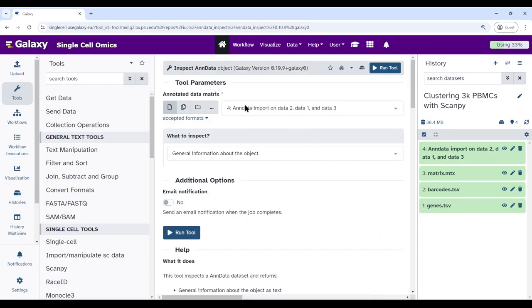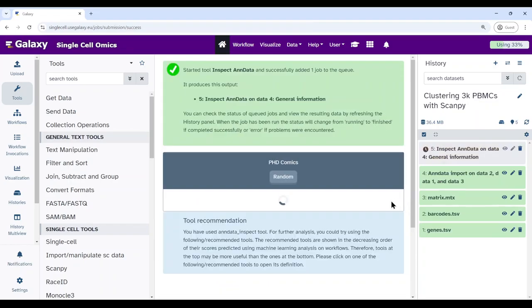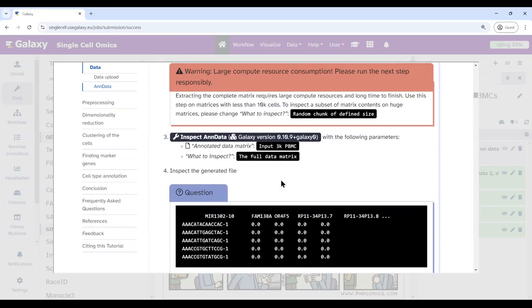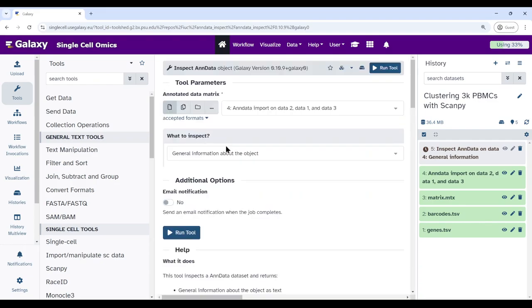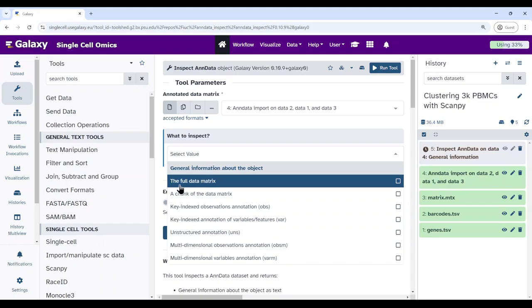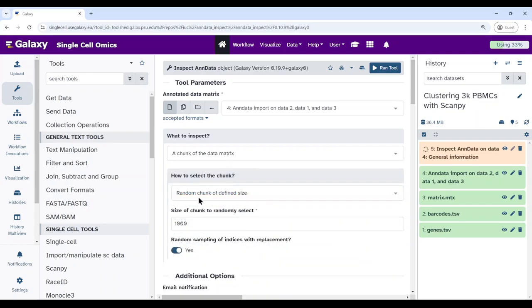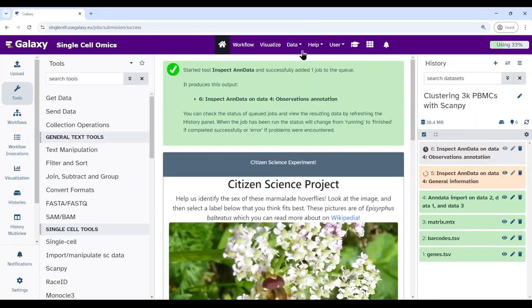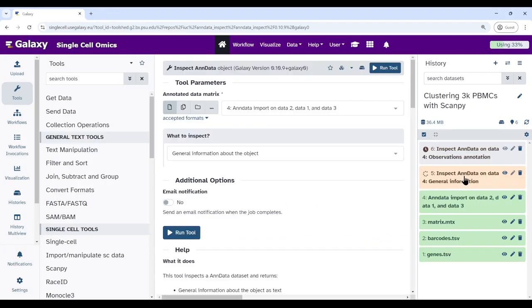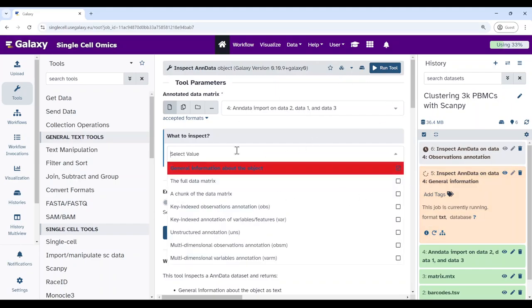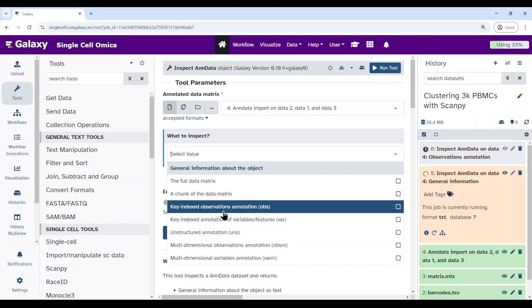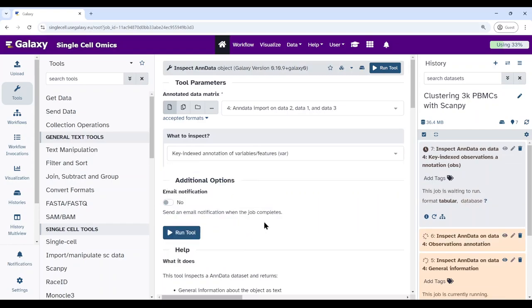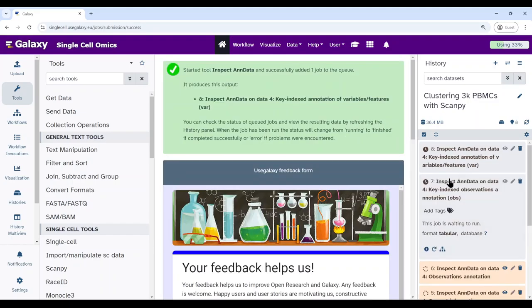Click on Inspect AnnData, select the full dataset, and run for general information about the object. We will also queue some more inspection jobs — looking at the count matrix, the genes, and the cell info. For the count matrix, instead of the full data matrix which takes a long time, let's take only a chunk of 100 cells. Then run the same tool again for observations annotation, and again for variables, which should generate gene information.